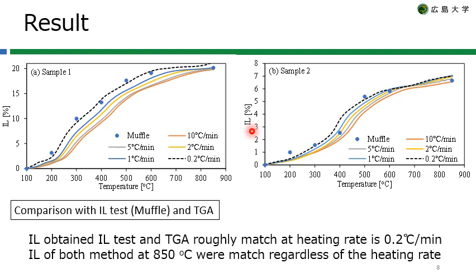On the other hand, the IL of both methods at 850 degrees matched regardless of the heating rate. From this result, it was shown that 850 degrees is useful for comparing the results of both IL.